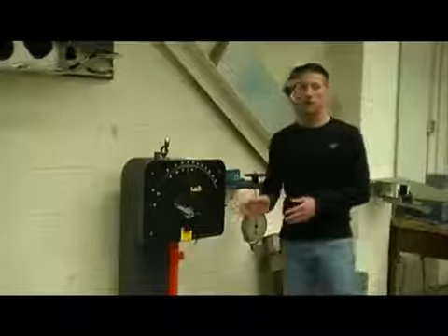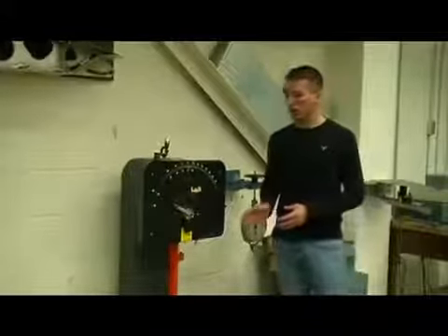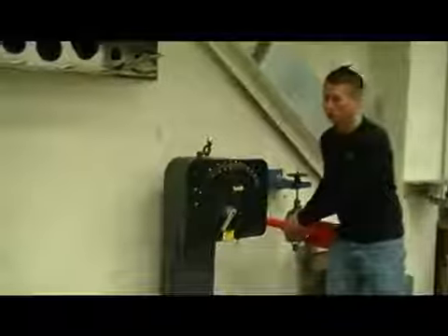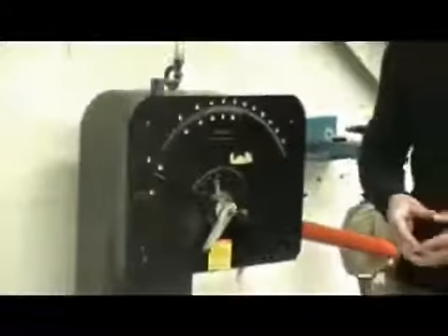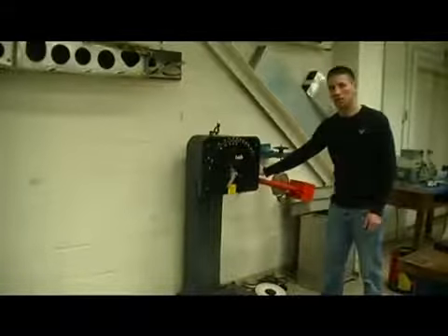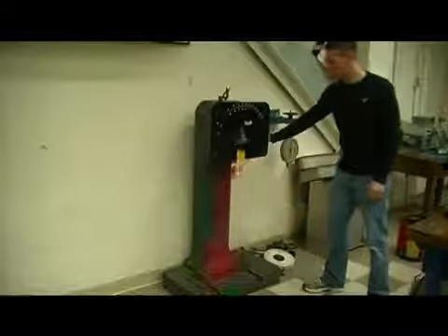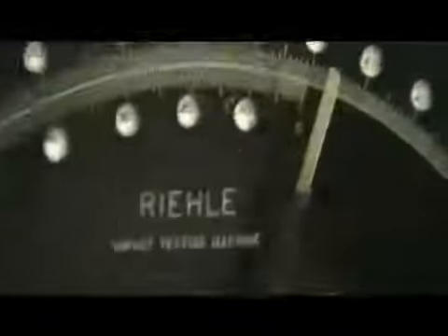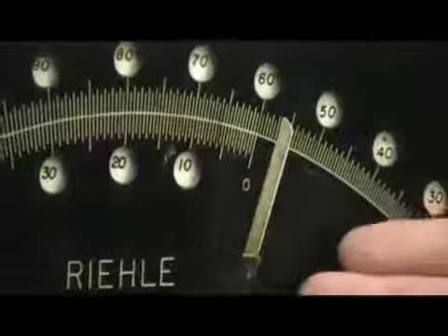Again, we need to make sure that the dial is zeroed on the Izod test machine. To do this, we're going to raise the hammer, locking it into its final height of 2 feet. We will push the dial past the end of the scale, and on this scale, the number reads 60 for that total potential energy of 60 foot-pounds, and we will run our test. Pushing, again, the lever towards the wall, the hammer swings through and we will slowly catch and release it back to its neutral position. Now, the reading on the scale will be our new 0 point from which we can measure all of our future experiments.